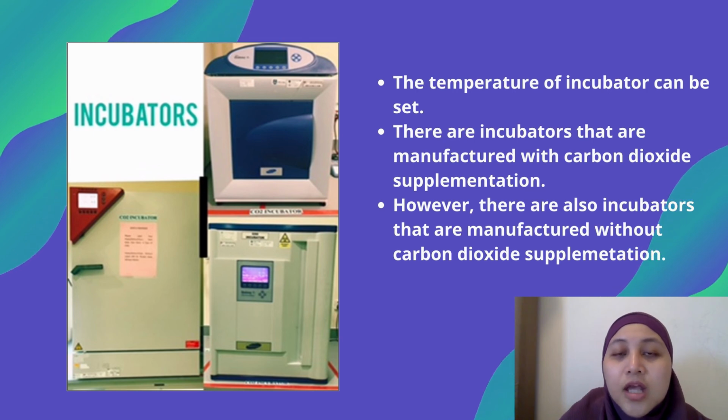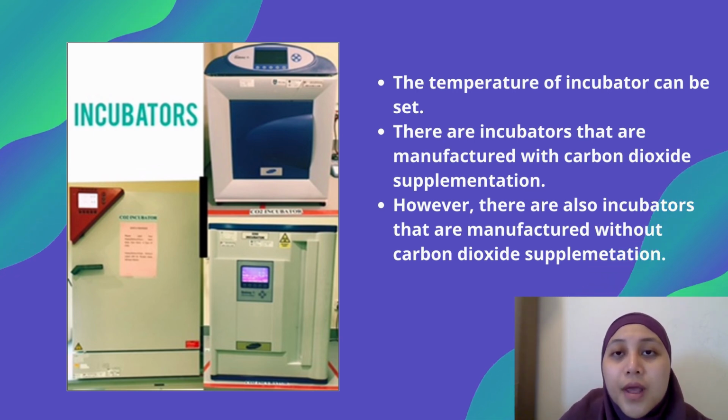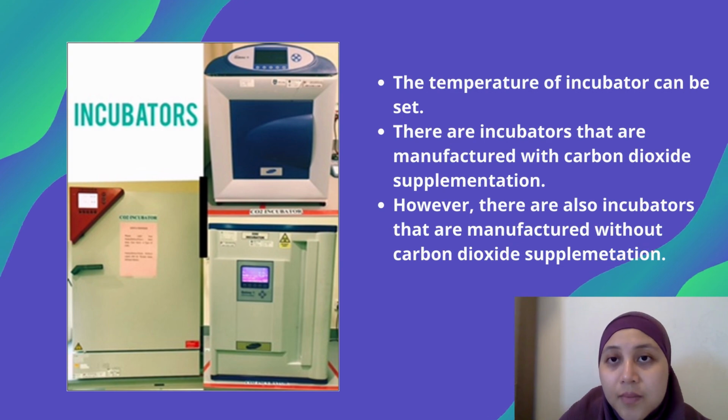Before using the incubator, ensure the incubators are cleaned up first and fill up the tray at the bottom with sterile water and make sure the temperature is stable.